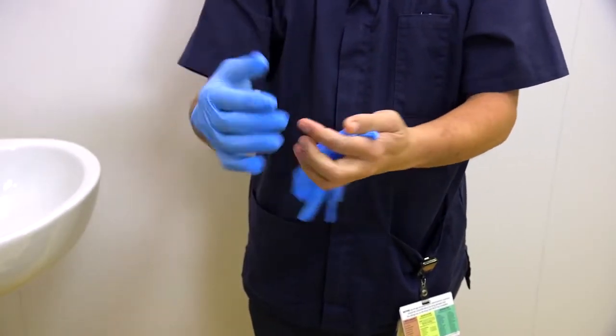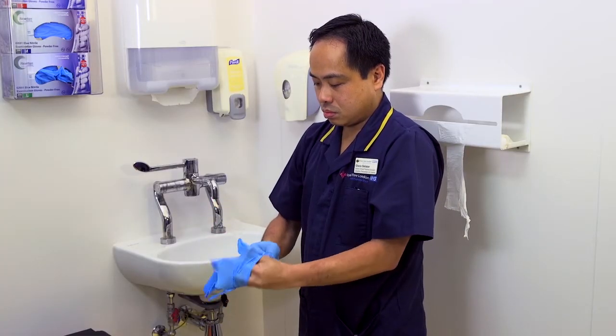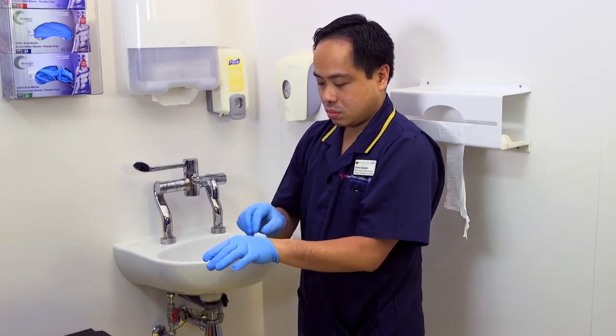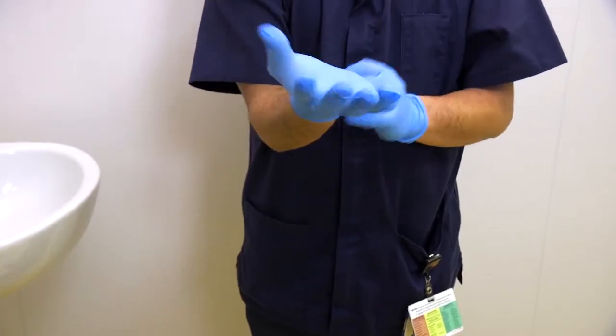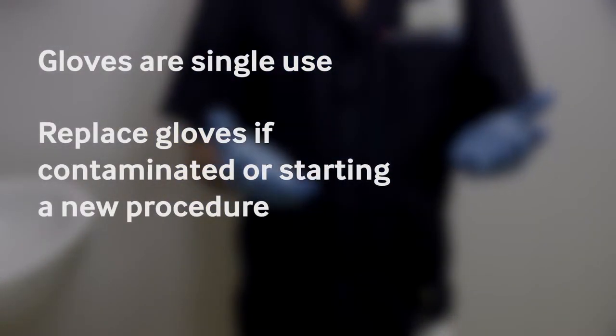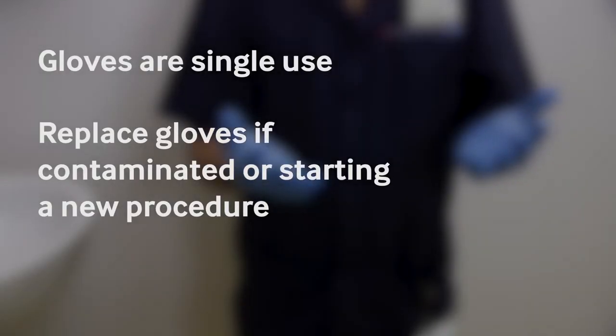These gloves are single-use disposable. If the gloves are contaminated, they should be removed and changed to continue a procedure or to start a new procedure.